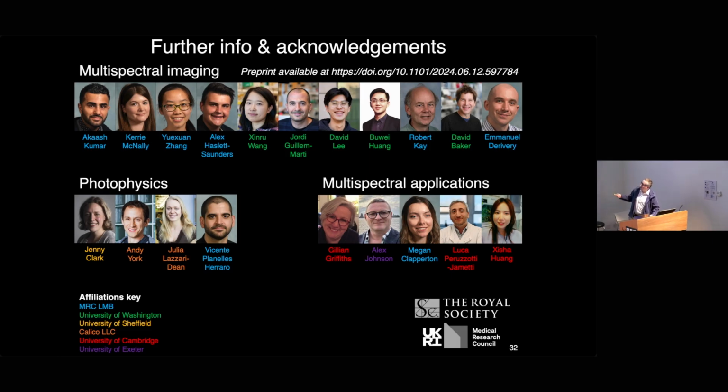I've only introduced these people for the multispectral applications, and what I haven't talked about, in the interest of time, is the exact details of the spectroscopy we've done to understand the photophysics of these fluorescent proteins. But particularly the transient absorption spectroscopy from Jenny Clark's group and the pump-probe spectroscopy from Andy and Julia have been very useful in understanding that, and Vic's been very helpful in actually purifying these proteins for use here.